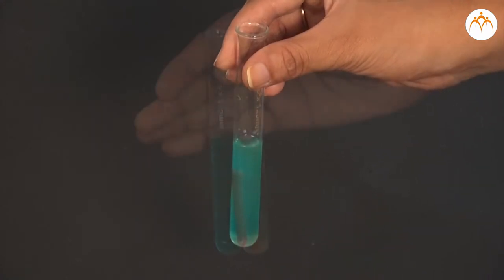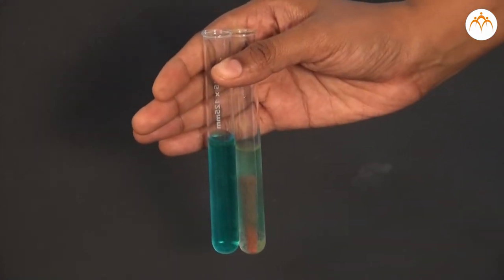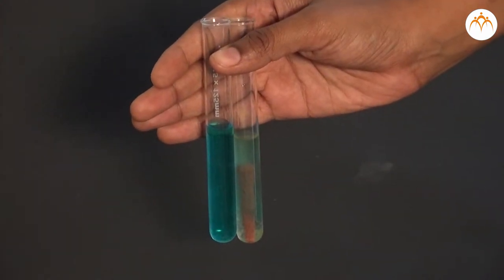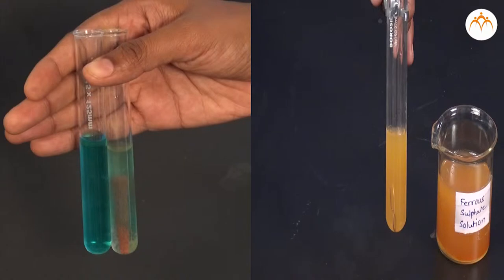Observe the reaction. The blue colour of copper sulphate turns to green and copper coating is formed on the iron nail. The reaction is taking place in the first test tube but in the second test tube there will not be any reaction between copper and iron sulphate solution.